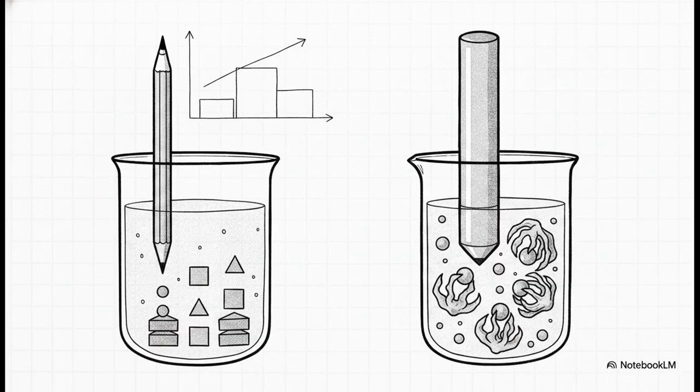But with potentiometry, using specialized indicator electrodes, like, say, a solid-state polypyrrole film electrodeposited right onto pencil graphite, we can actually titrate a mixture of halides with silver nitrate simultaneously, and we get these perfectly separate, super sharp inflection breaks for every single one. Meanwhile, complexation titrations use tools like the copper ion selective electrode.